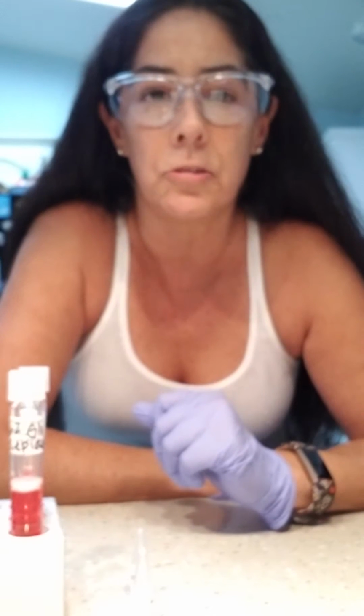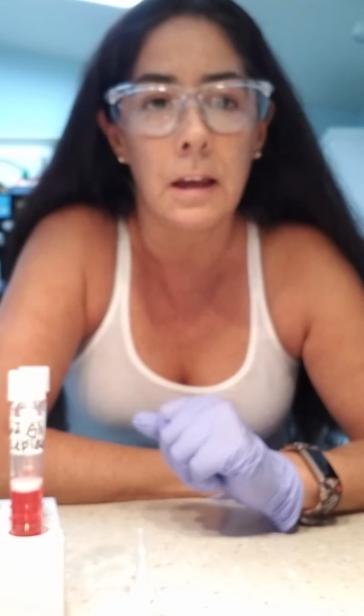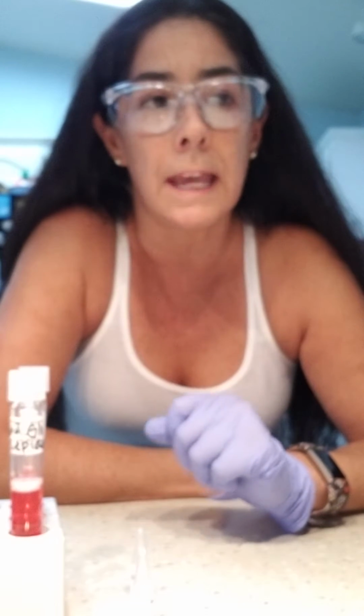This is Dana for BIO225, and today we're going to be doing the carbohydrate fermentation test. The purpose of this test is to determine whether or not bacteria can ferment a specific carbohydrate. Carbohydrate fermentation patterns are useful in differentiating among bacterial groups and species.